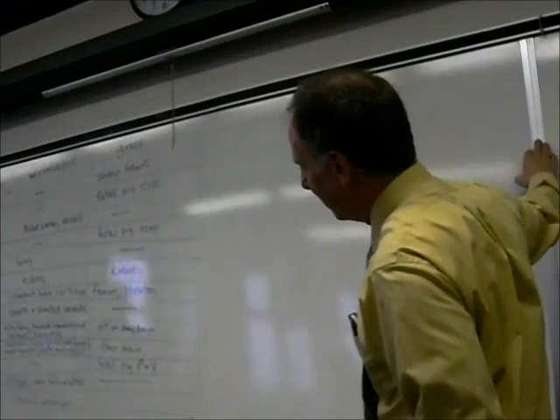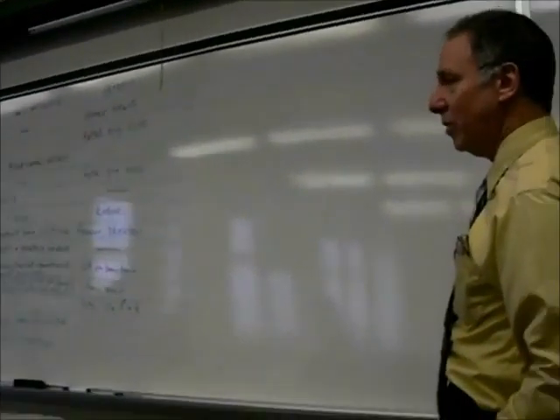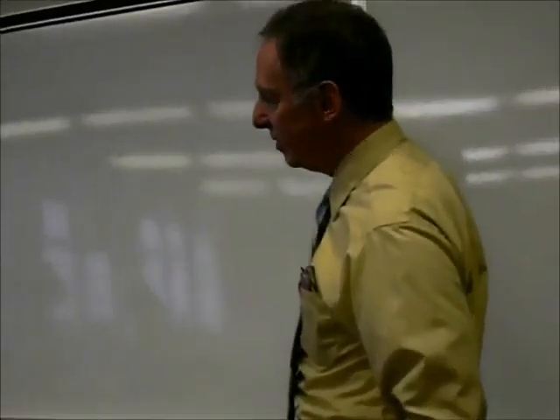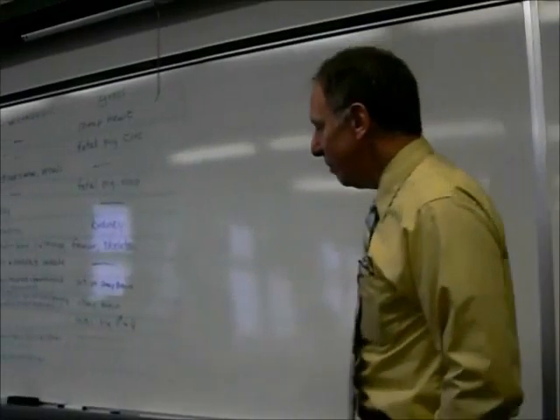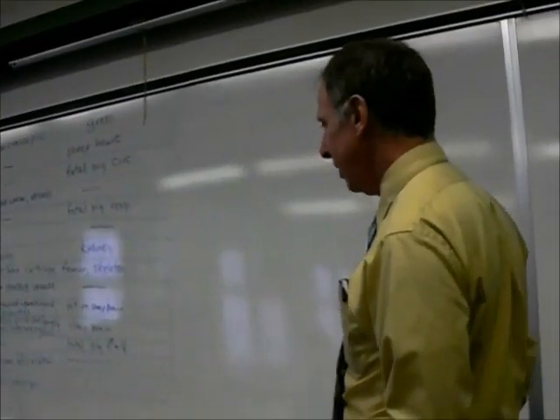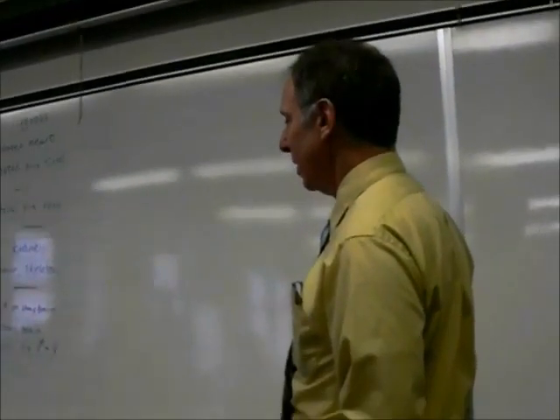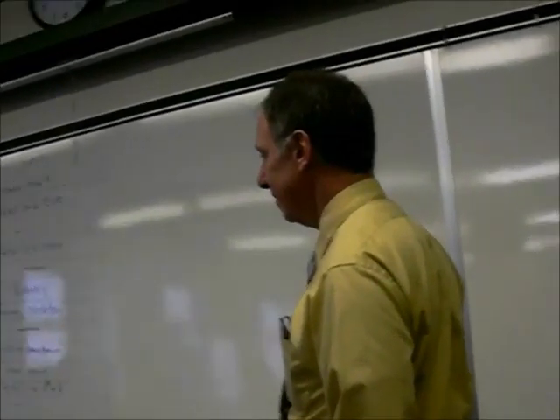19, the mammalian and frog spinal cord, and the frog ganglia, the motor neurons and motor end organs also, and gross specimen, the sheep's brain.